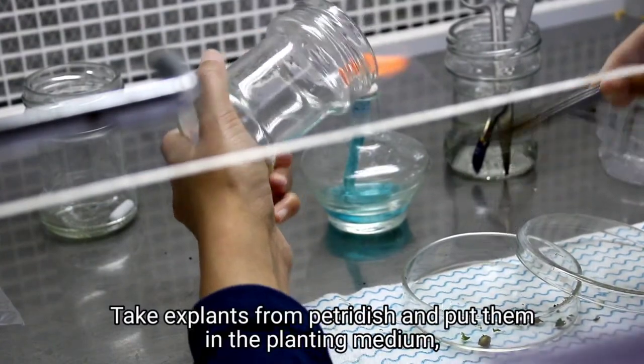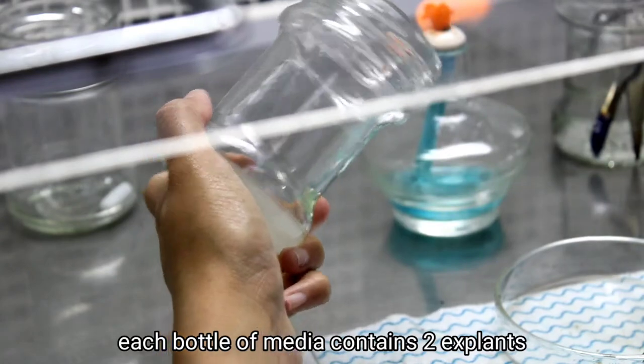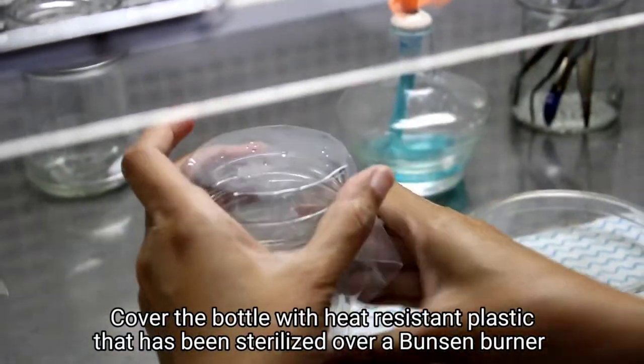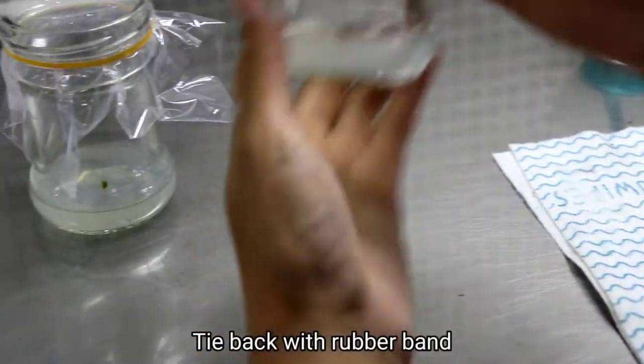Take explants from the petri dish and put them in the planting medium. Each bottle of media contains two explants. Cover the bottle with heat-resistant plastic that has been sterilized over a Bunsen burner, then tie back with a rubber band.